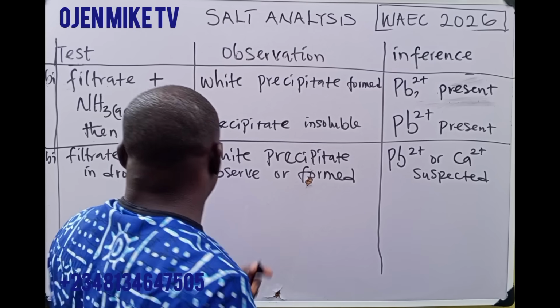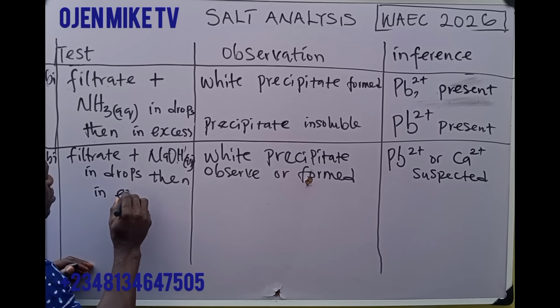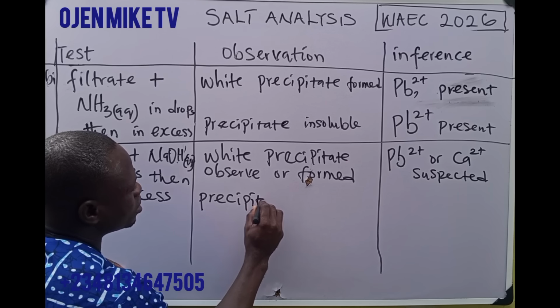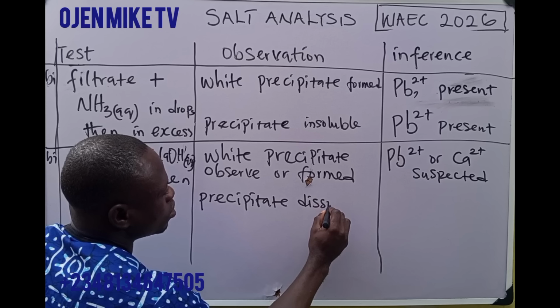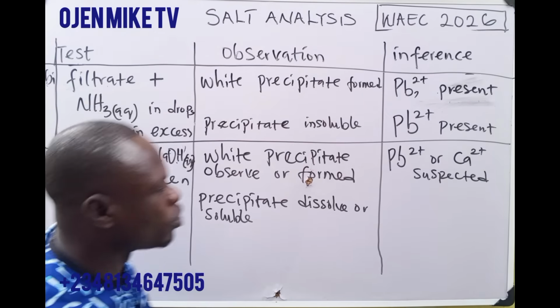Okay? Now you added this one in drops. Then in excess, you say precipitate dissolve. Precipitate dissolve or precipitate is soluble.